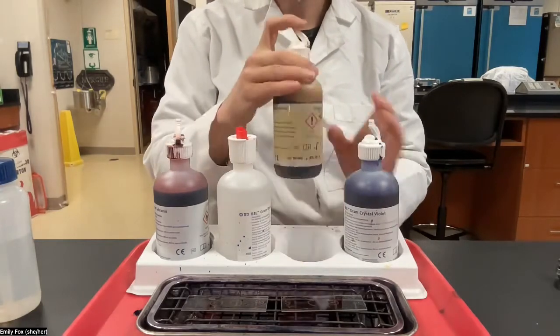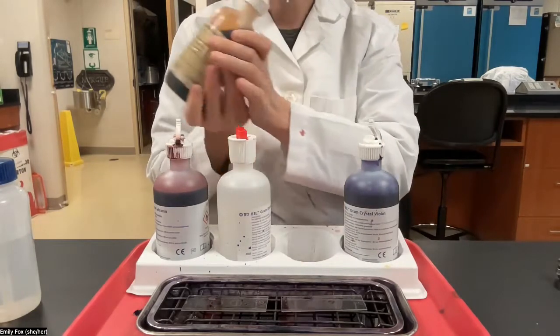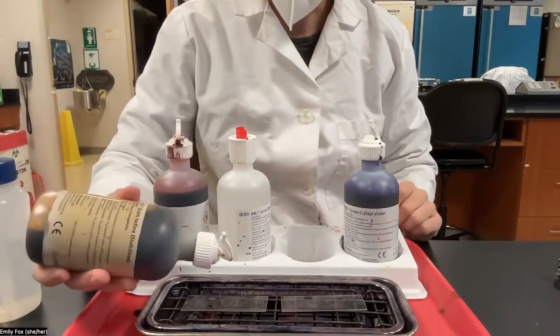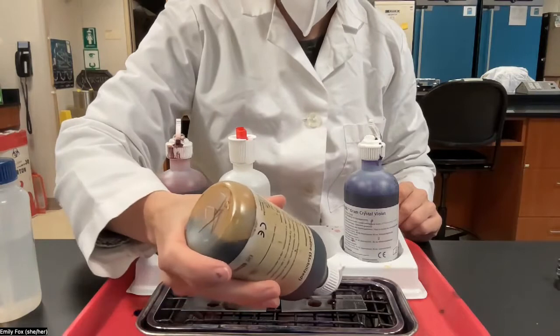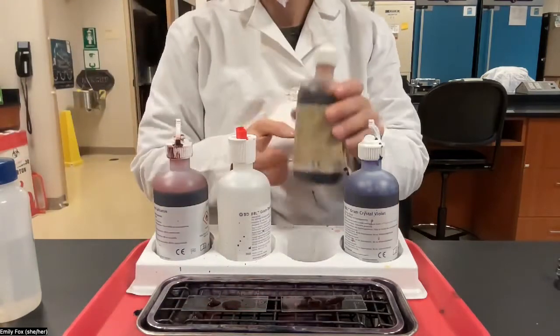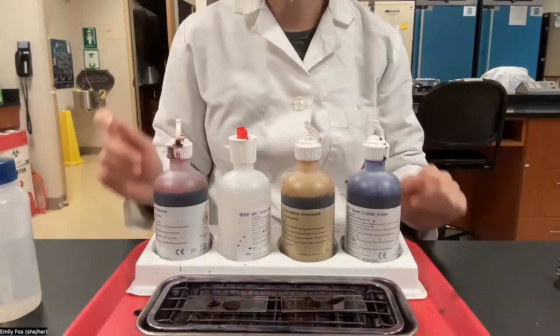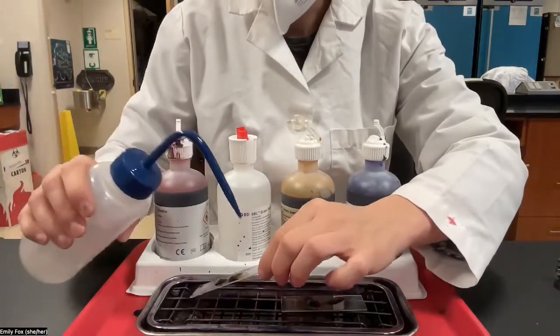We can just move straight to the next step, which is adding iodine. So now we'll do iodine for one minute. Again, just make sure you cover your two circles on each slide. That is enough. So now set your timer for one minute. And we're ready to rinse.